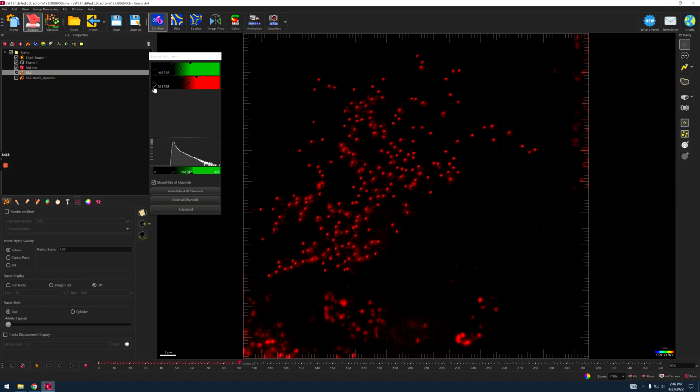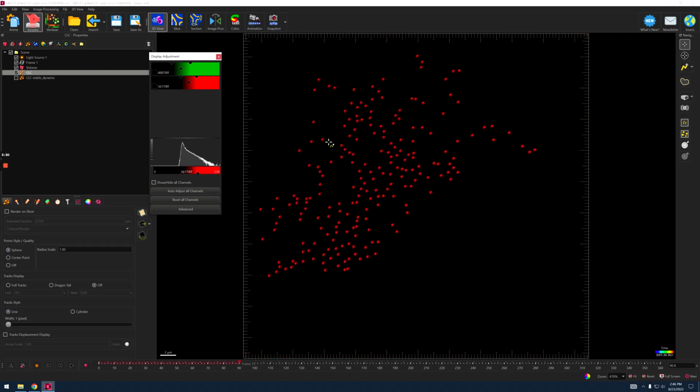During my analysis of the clathrin light chain spot module, I prefer to turn off the images. So here I click off, and the clathrin light chain you turn on. Remember here that your track option is selected, so now everything that you are analyzing is track, not just one single spot.